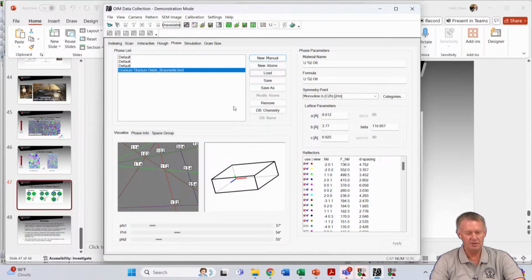So there's a database of several hundred that have been done. And always when we come up with new stuff, you know, we're looking at a new material, some rock we've picked up out of the street, something that's giving us diffraction, then we go in and create a new data file for that. Okay. So yes, the answer is yes, you can do a whole bunch of different types of structures.